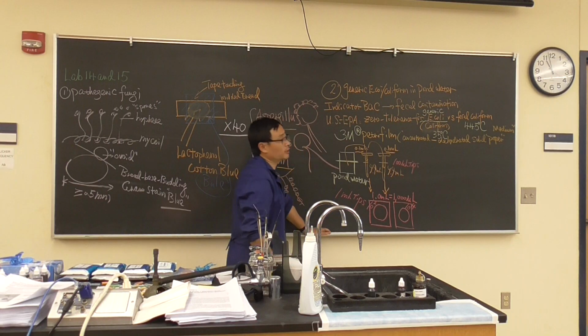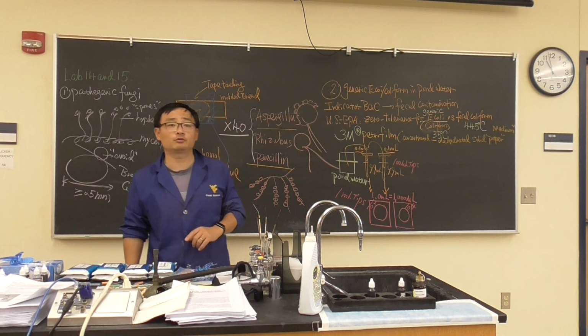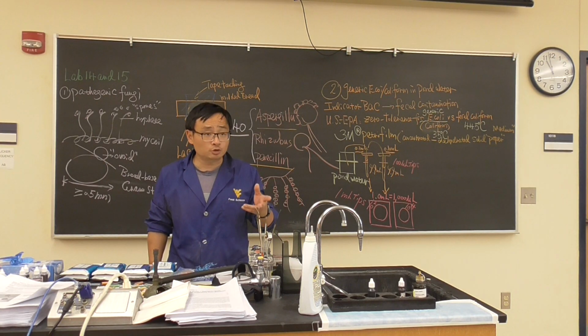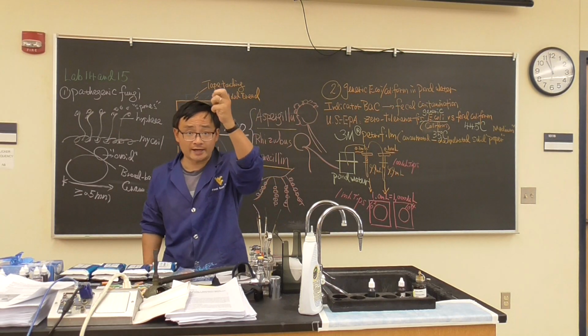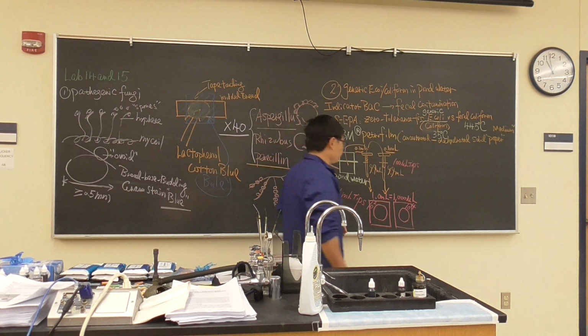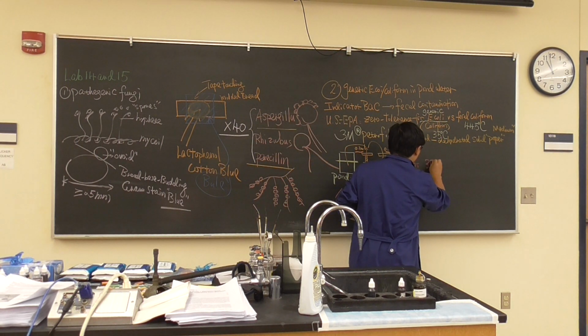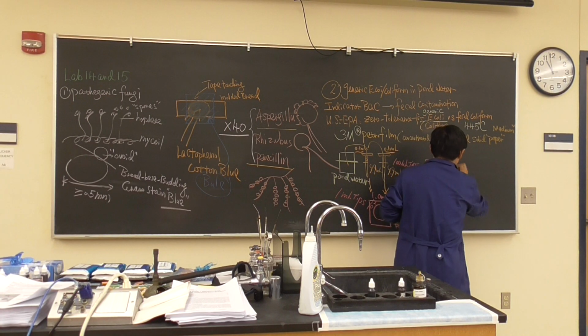Unfortunately, I only have 2 pipettes. I will find one in our lab. Rion will bring another one from the other lab. So you guys do the dilution first, then take turns to add them onto the petrifilm. Okay? This petrifilm, when finished, we are also going to incubate at 35 degrees Celsius, usually 24 to 48 hours. The results will be very interesting.